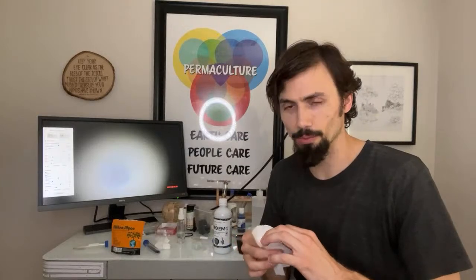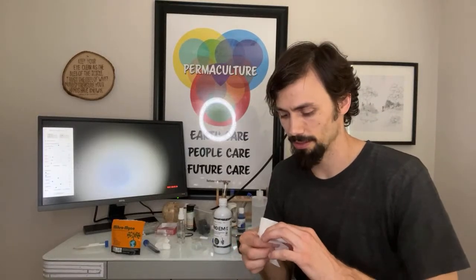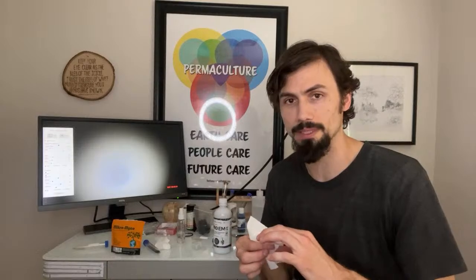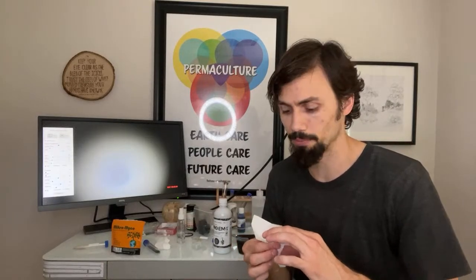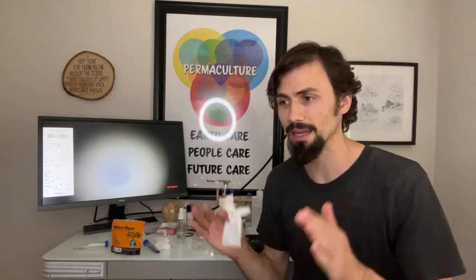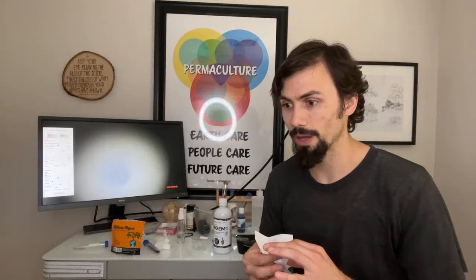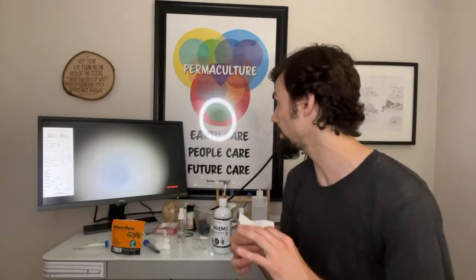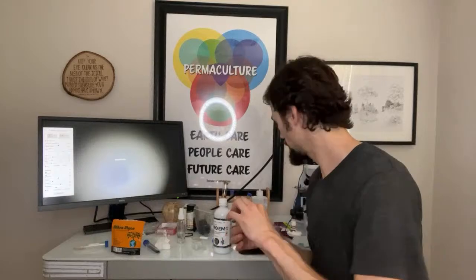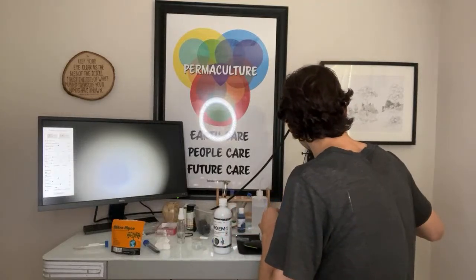And notice how, like, we're just busting through samples here. It really is that easy, and it's that instantaneous. We were looking for symmetrical shapes. And if we wanted to ID them, we'd pull up the key and start walking through that. But I typically do the foray first, and I gather the information. And then I go back and I edit it down to those things that I want to research, and then I go through them. It's much easier than trying to do it all at once. You end up getting bogged down doing the research while you're still doing this, and then you have that going on and eating up your memory. Sorry, I don't want the memory to run out.